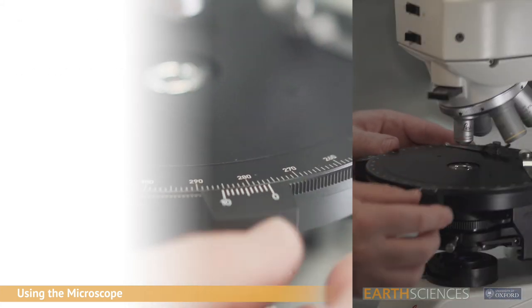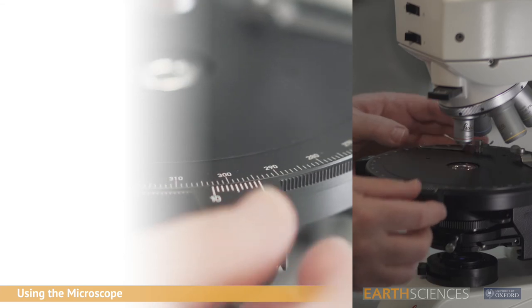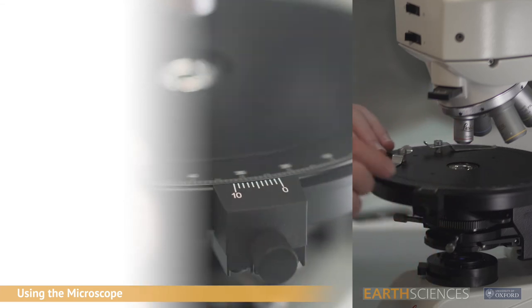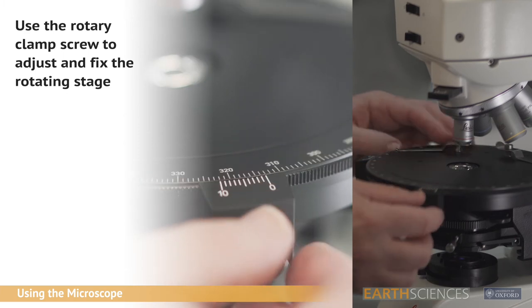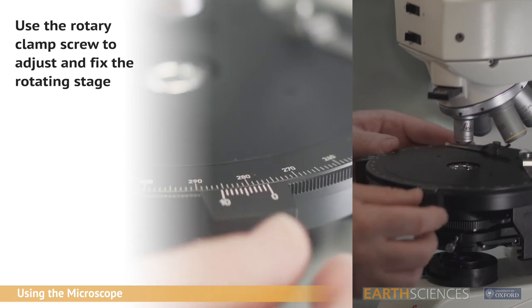The circular rotating stage is marked in one degree increments and has two verniers allowing one tenth degree measurements. To the right-hand vernier block is a rotary clamp screw to fix the stage in position.